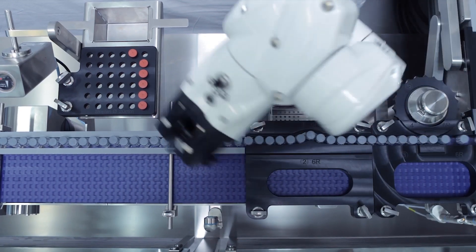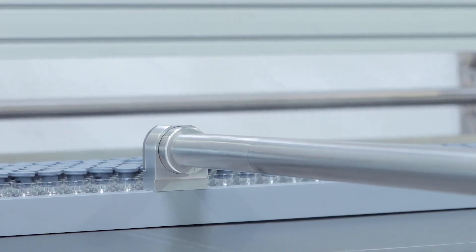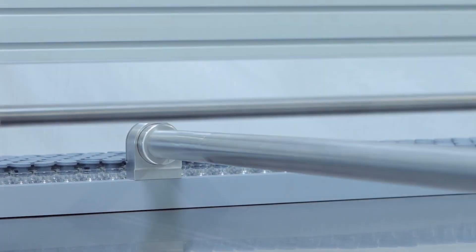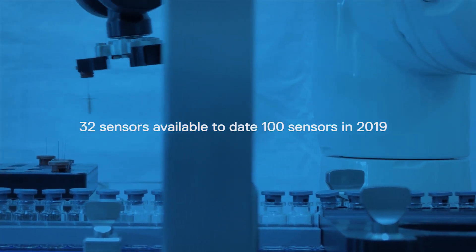Tempris enables you to find these critical positions with up to 32 sensors in 2018 and up to 100 sensors planned from 2019.